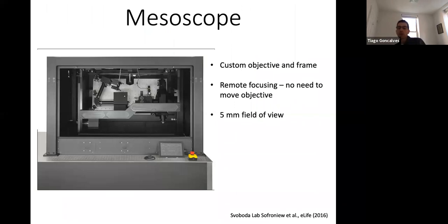You saw that huge crystal skull window. This is one of the big new things, maybe about 4 or 5 years old. So this is the objective. You see this gigantic thing. This thing takes up a whole room. It's like a huge gantry with a microscope attached to it, and then there's a tiny mouse somewhere in there. Your microscope is just gigantic.